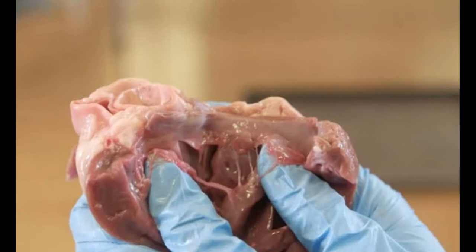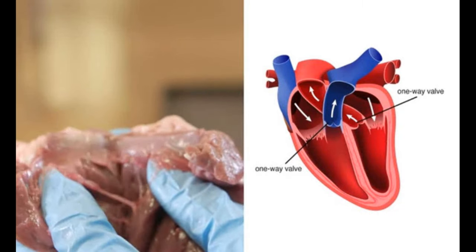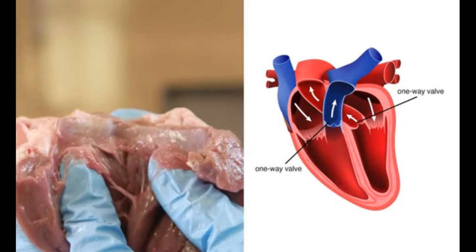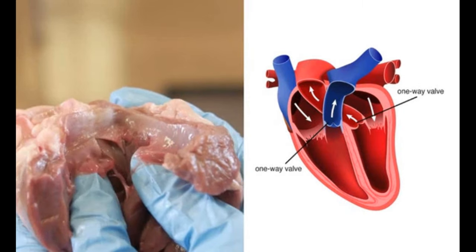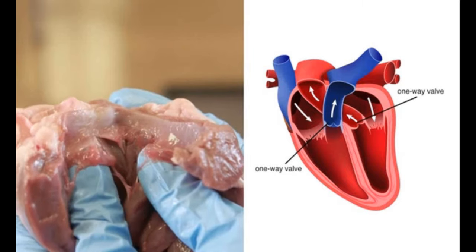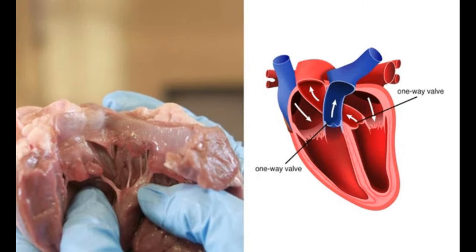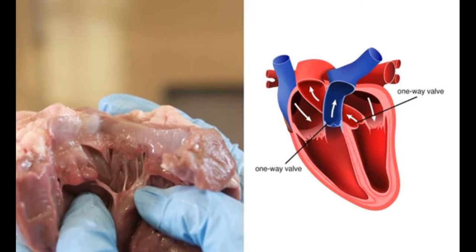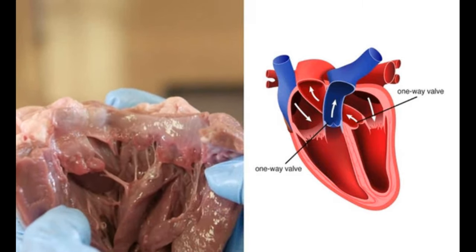The aorta has been cut open to show the one-way valves inside. The valves allow blood to flow out of the left ventricle into the aorta, but not back into the ventricle again. They are forced open when the heart muscle contracts and pushes on the blood, and they flap shut when the heart muscle relaxes. The pulmonary artery also has these valves.